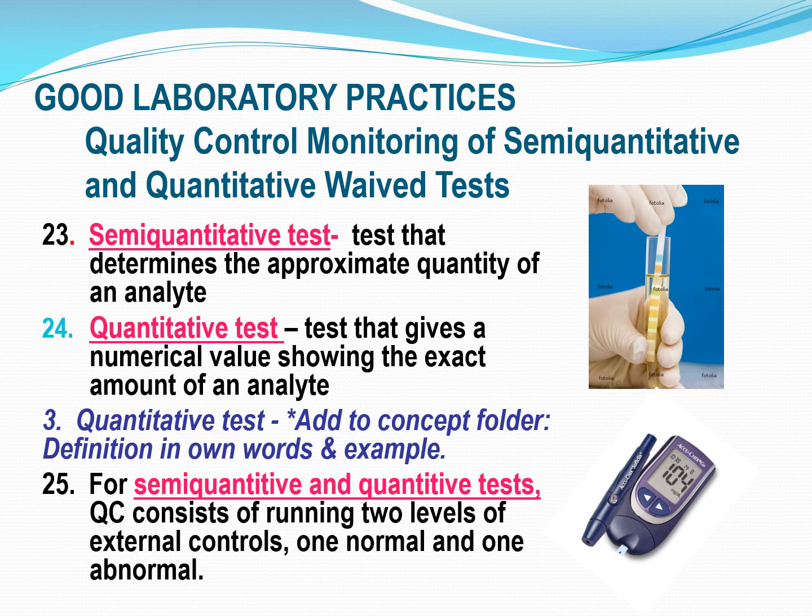Okay, we're still on good laboratory practices, because this is vitally important. We want to make sure that we are following all the rules and regulations. We're doing everything correctly, because these results that we're giving to these doctors, these physicians are using these results to diagnose, monitor, and treat our patients.